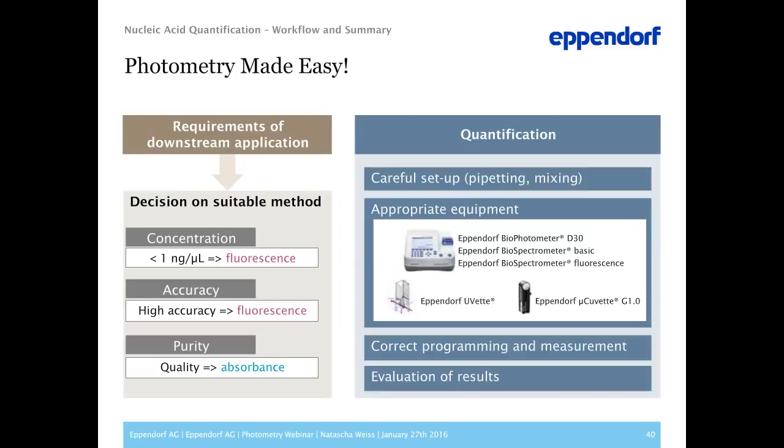For the quantification, the following procedure is reasonable. The setup has to be done carefully with regard to pipetting accuracy and mixing. The appropriate equipment consisting of device and cuvette has to be chosen. Programming of parameters and measuring of blank and samples have to be done in the right way. And last but not least, evaluation of results according to the sequence presented before is helpful.